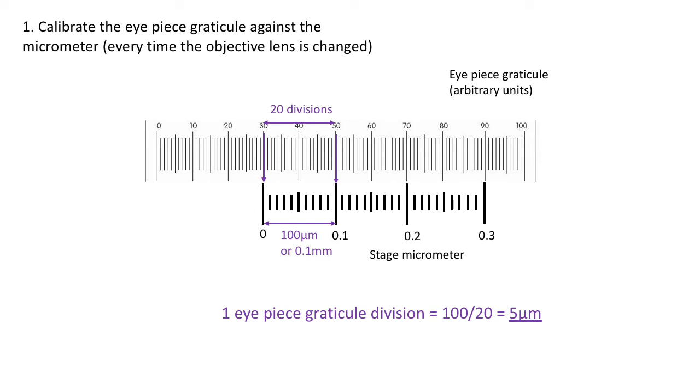Now you know that one division on your eyepiece graticule is equal to 5 micrometers. You can move around and look at all sorts of areas on the slide, and you will always have the eyepiece graticule in your vision. You can now use that to measure anything you observe by lining up any cells against the eyepiece graticule.